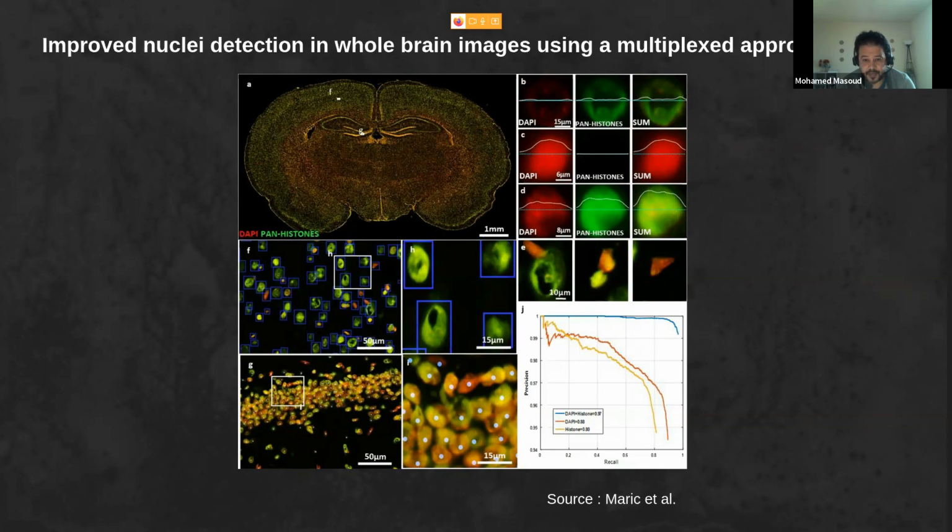So the results in this case, when they are combining both, as we can see from the graph, it gets much better accuracy. When they are using DAPI alone, it was like 0.88 area under the curve, and when they are using the pan-histone alone, it was 0.8.